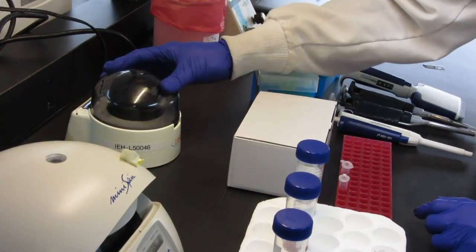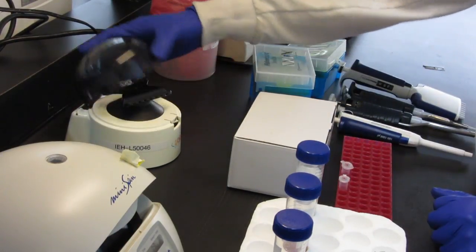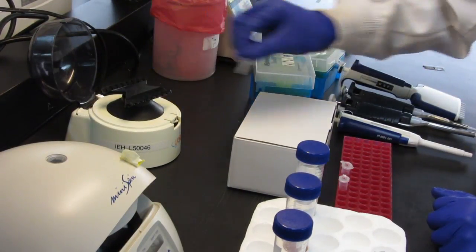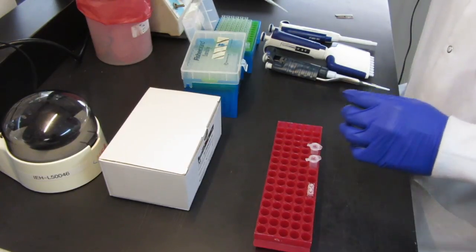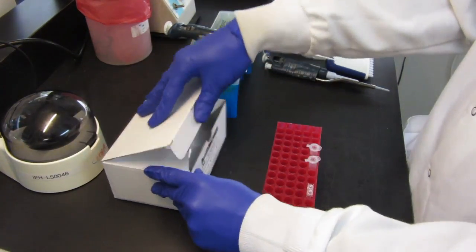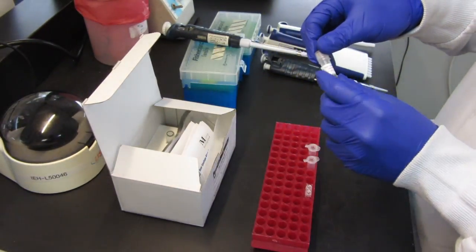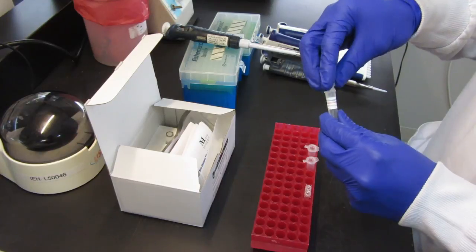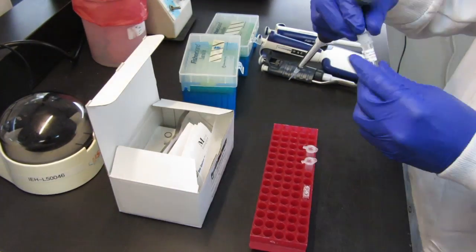The final step is amplicon detection using DNA lateral flow strips. You will start by centrifuging the amplicon PCR products you just produced to bring all liquid contents down to the bottom of the tube. Next, in a fresh 1.5 milliliter polypropylene tube, you will want to mix 120 microliters of the detection reagent with 10 microliters of the amplicon PCR product you just produced.